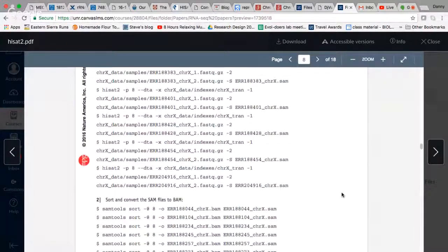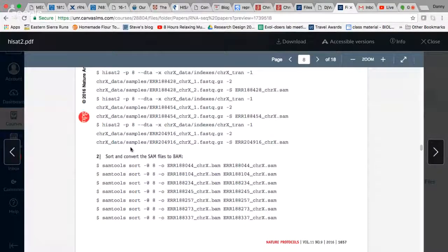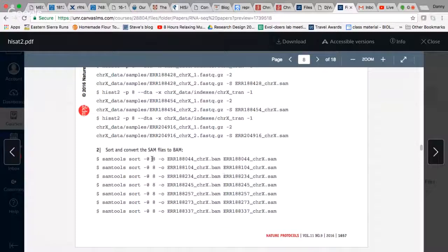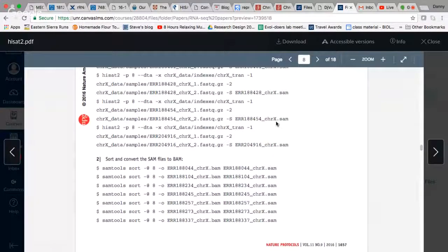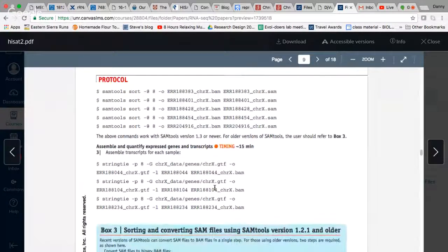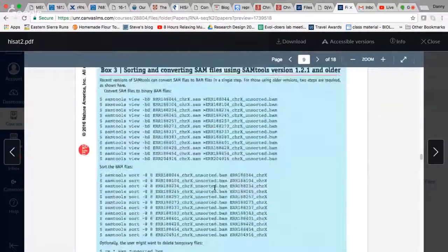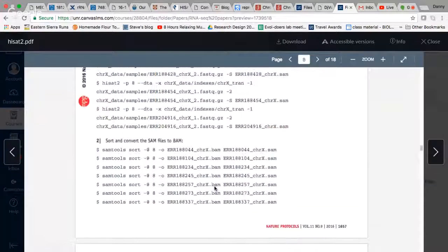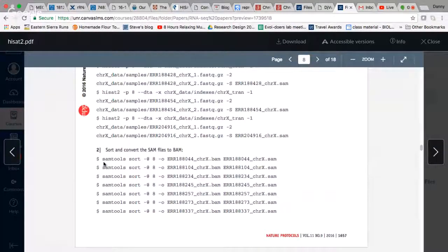What I wanted to do today was work through step two: converting SAM to BAM. The SAM files that were created previously — we're going to use SAMtools, which is another software package we'll download. It will help us convert those SAM files into BAM format, and when we're done with that we're going to index them and create a BAI file.